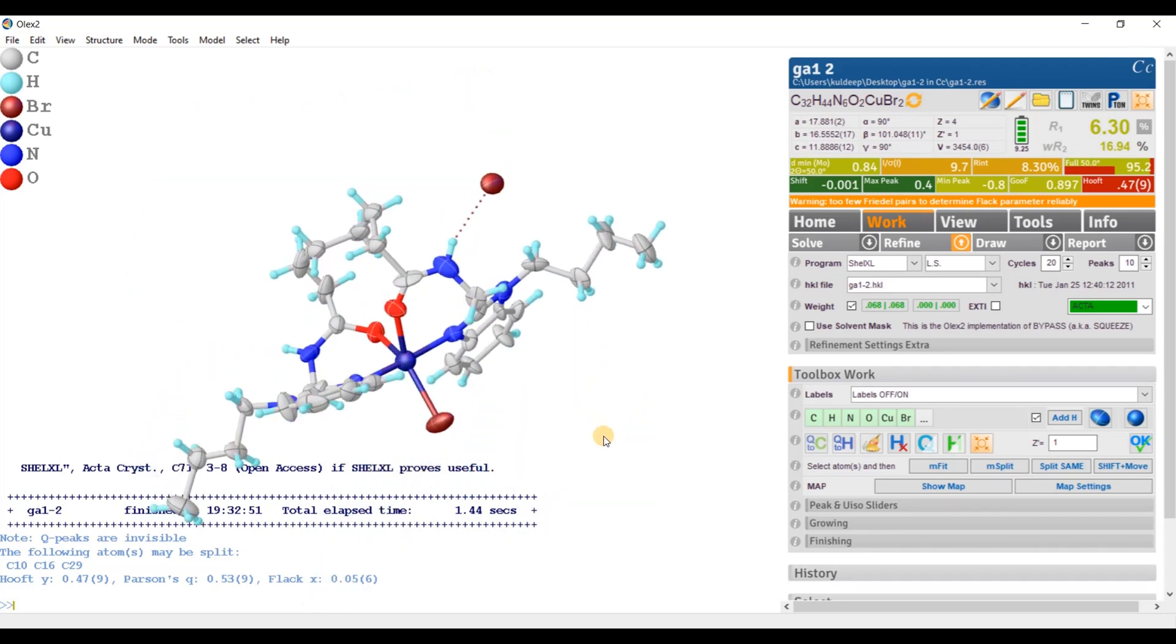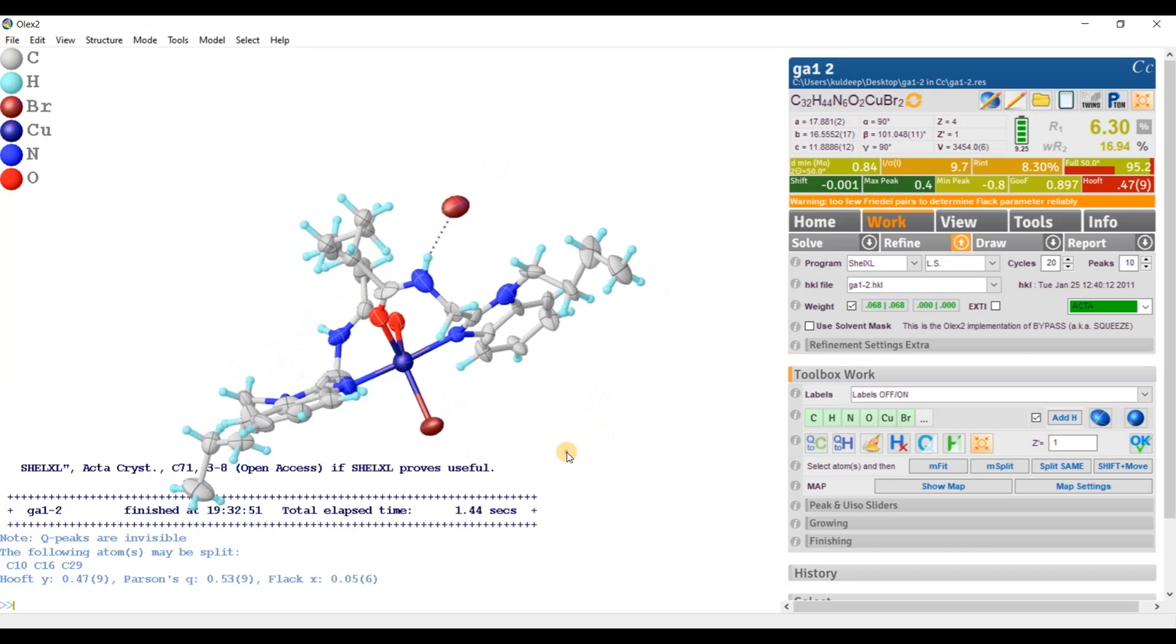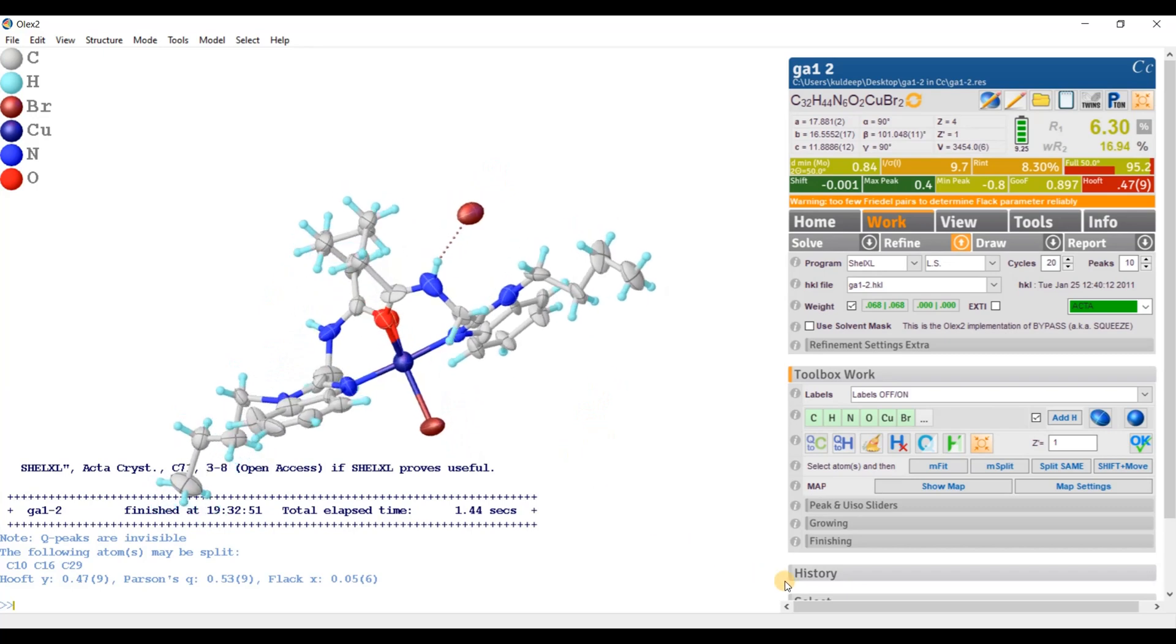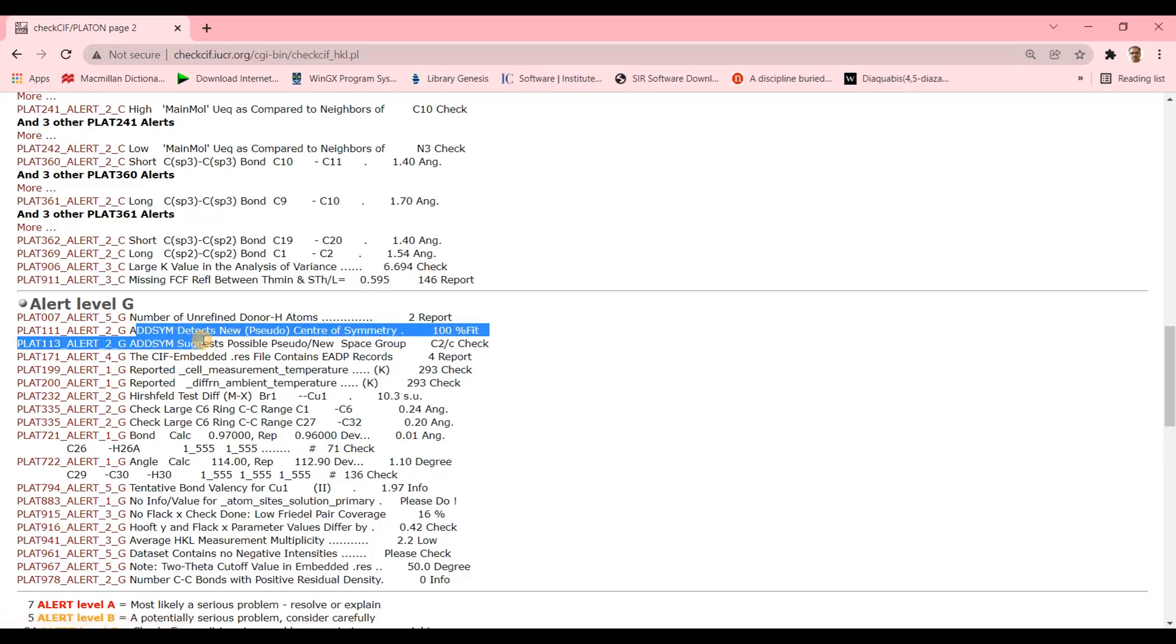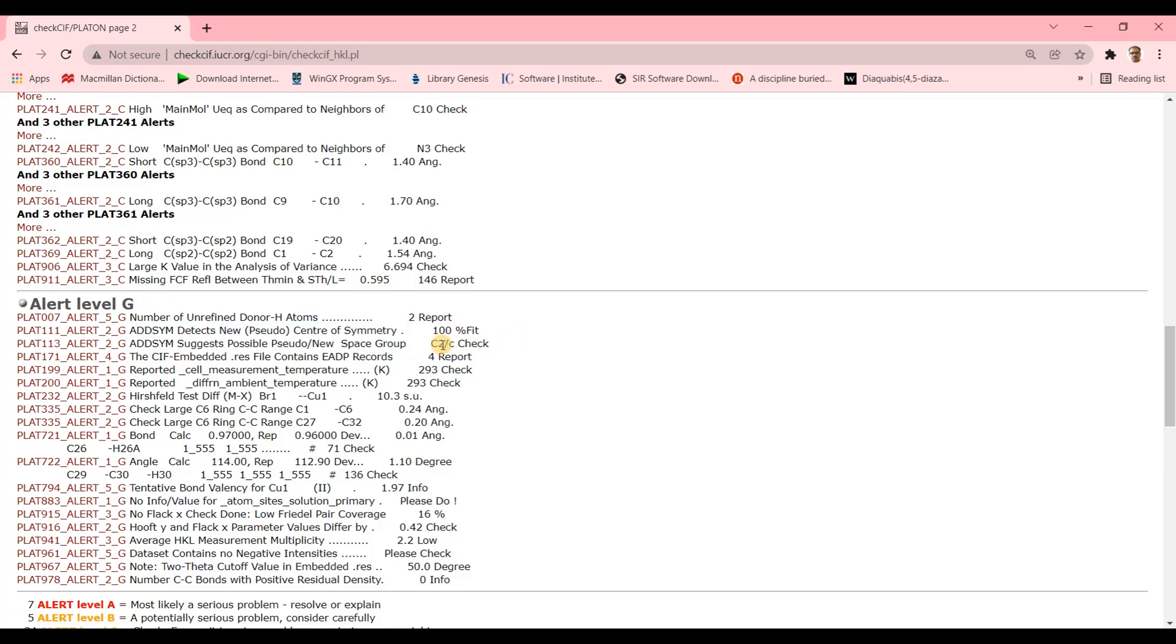But upon the validation, I am getting an alert like this one. AdSym detects new pseudo space group. So and the space group suggested C2/c.